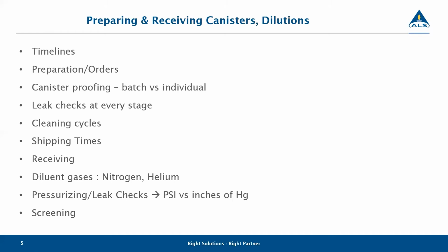The batch proofing is what you see on your report. So why is the individual proofing nice to have? Because you do not need to ask for that individual proofing in advance. Say you get your results and you're looking at it thinking, you know what? I've never seen acetone at this site. Why am I seeing it now?